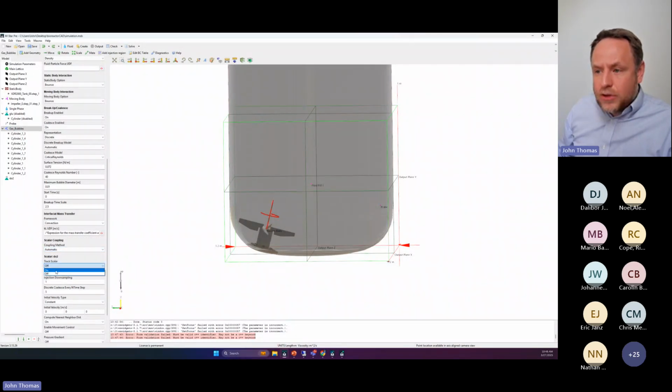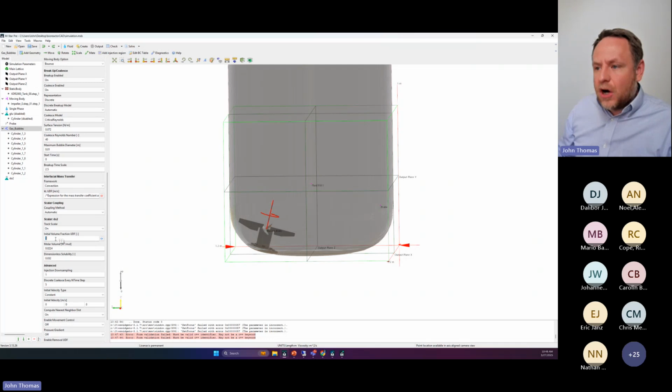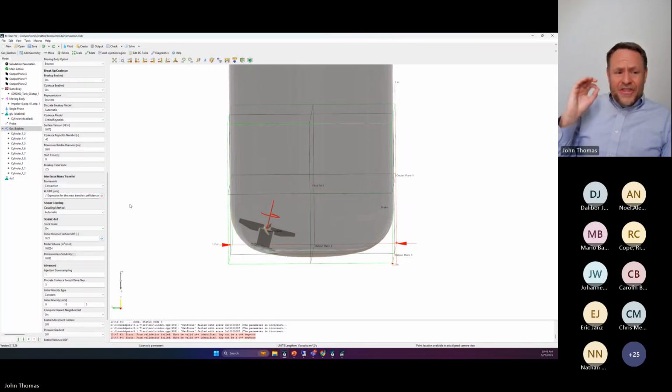I will track DO2. I will say that these are, say, air bubbles coming in, 21% oxygen, with a given molar volume and a given solubility. That informs what sort of mass flux we'll see. KL is the convective mass transfer. This describes the transfer rate as a function of the concentration difference and the convective mass transfer coefficient KL.